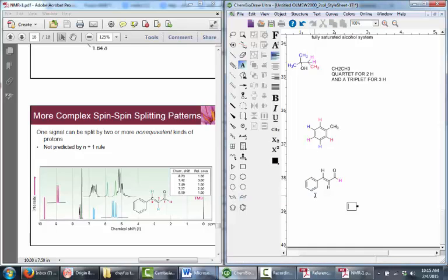He's very de-shielded. He integrates to 1. Everybody's happy. Now, let's focus on the aromatic region. Here we have a mono-substituted benzene ring, which is going to give me a mess in the aromatic region. Those are the black protons that we see here in the spectra. So let's put those all in.